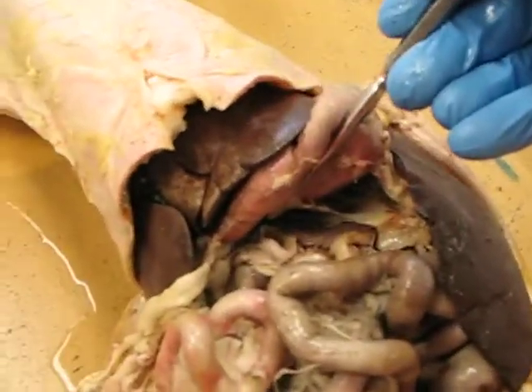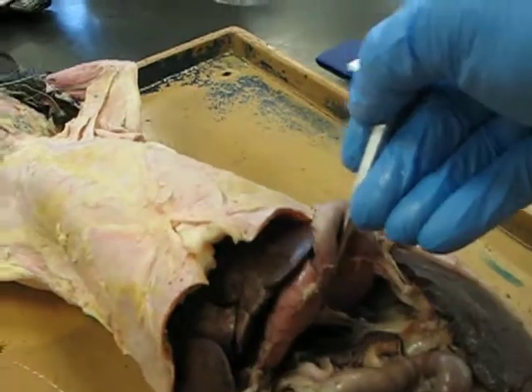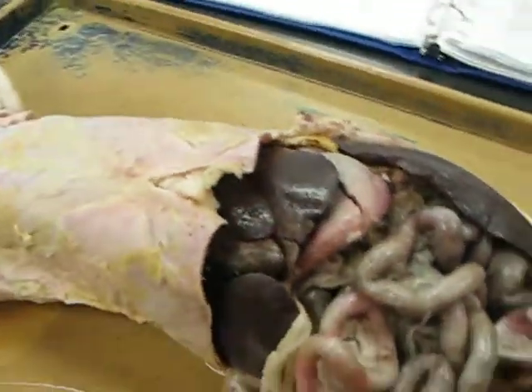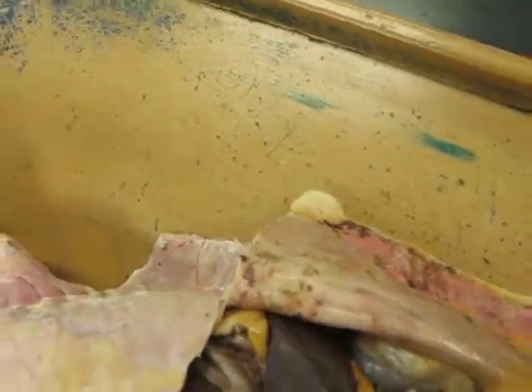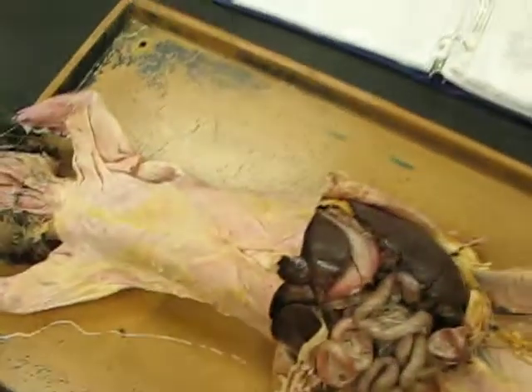Directly underneath the stomach, this little brown portion here, which is kind of hard to see with one hand again, is the pancreas. And then we have 2 kidneys, one of which is easy to see, which is right there. There's a kidney right here, pointing at it. Kidney. And that's about it.